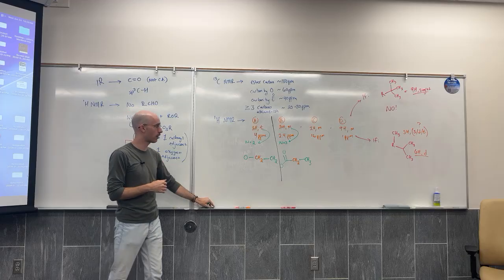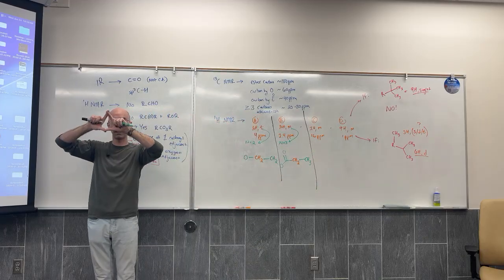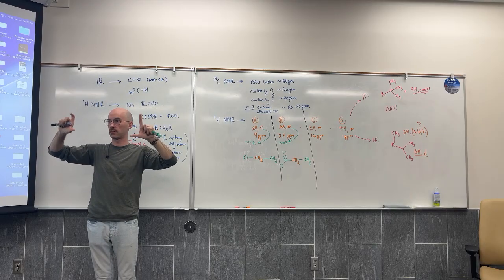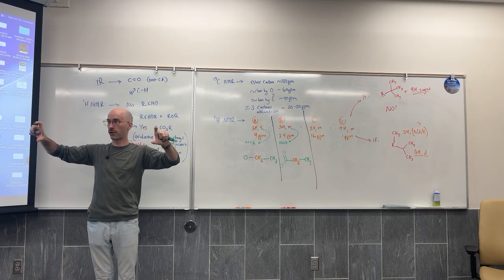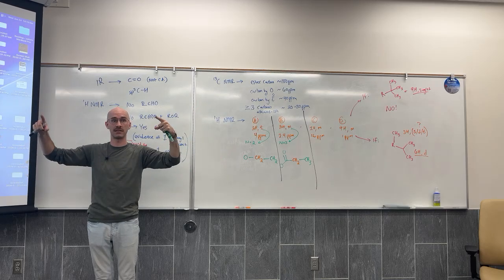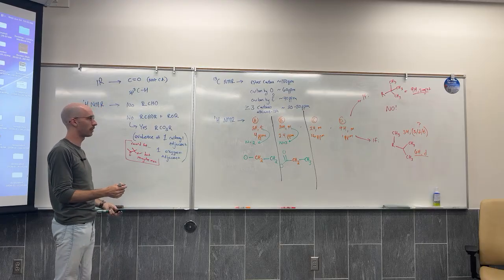If you're following along, we have just determined the structure around the ester. The OR group is connected to a CH2, and the carbonyl is bonded to a CH2. And that's all that we've determined right now. So what we need to try and do is wrap up the chains. This is either going to be a ring. Let me pull back a little bit.